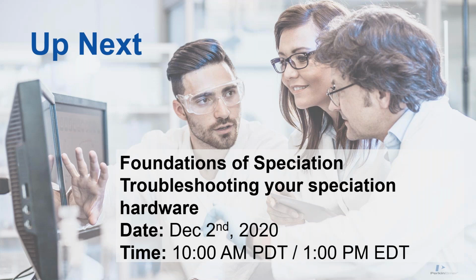So can the Avio 200 use IEC and MSF, or is it only the Avio 500? You can absolutely do it on both Avios. The software is the same. Exactly, and spectra is spectra, right? Yeah. So it's how it's dealing with that spectra. It doesn't matter what sort of detector or anything.